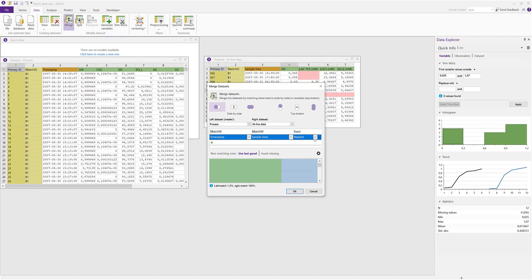Forward means that every at-line sample row will be matched to the nearest process data row after the sample time, aligning it forward in time. This setting ensures that the sampled at-line data will never be assigned to a process data row of an earlier timestamp. We can now see in the merge visualization that the darker blue at-line rows have been matched on different locations throughout the process data.